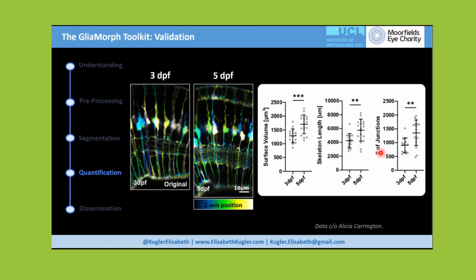Can we, instead of looking at all the cells within our field of view, just look at individual cells? And we could do this with 2 different approaches. The first one is computationally extracting individual cells, and the second one is to experimentally visualize individual cells. For the moment, we're unfortunately not able to extract the individual cells. We're still working on this, and hopefully, cross fingers, this will work. But for now, we work with experimental data.